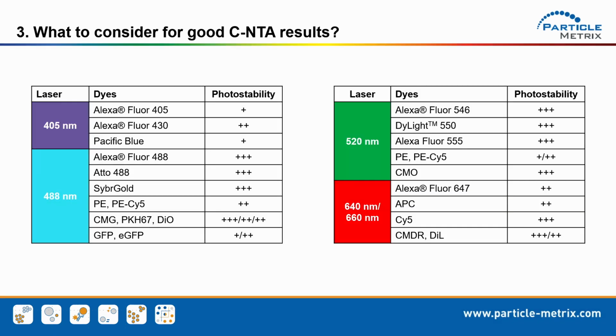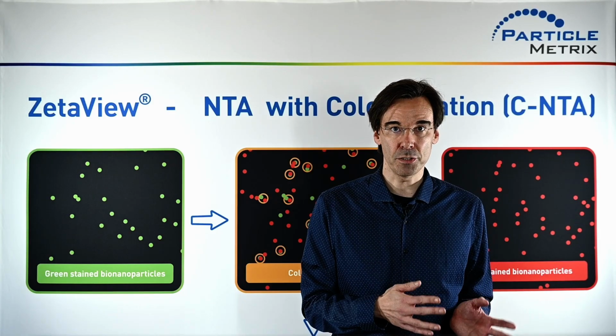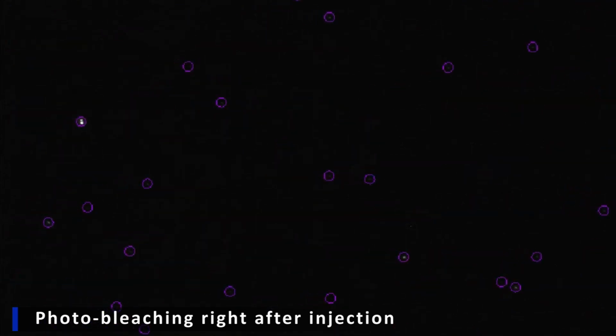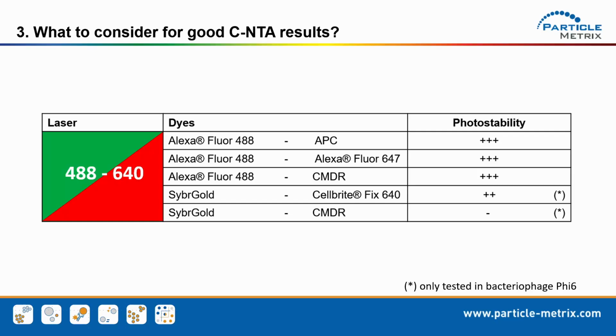The keyword here is photobleaching. And no, it's nothing to be afraid of. Photobleaching has to be taken into account wherever you work with fluorescence, not only with colocalization NTA. The great thing about the ZetaView instrument is that you can immediately see photobleaching in the live view, even without having to start a measurement. When doing multistaining, you should preferably choose combinations of photostable fluorophores.